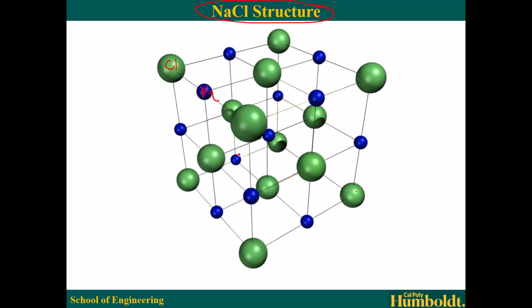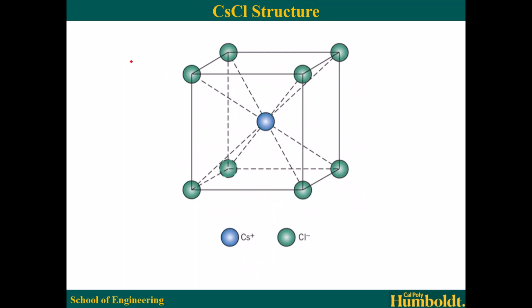And we'll get more into that structure and how we are going to calculate selection rules for this. The interesting thing is you should expect to see superlattice peaks show up, peaks that are different in magnitude depending on whether the diffraction adds these two diffraction components or subtracts them. That'll become clear once we start to derive things.